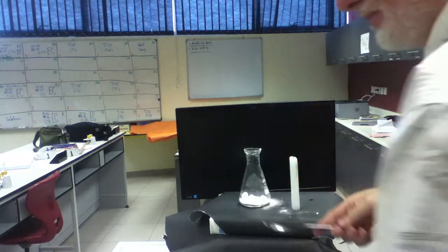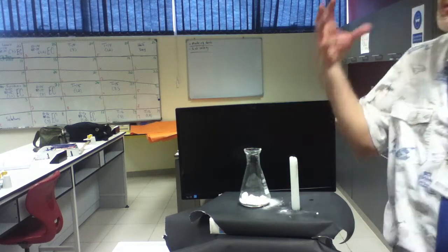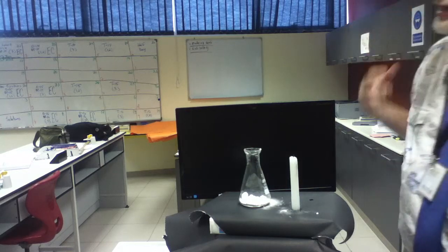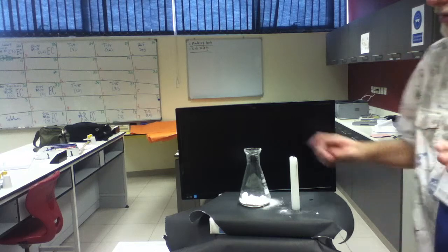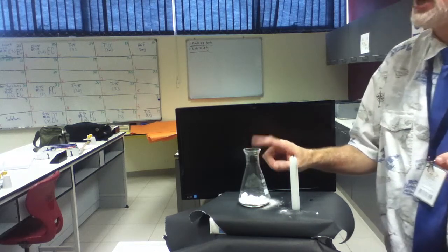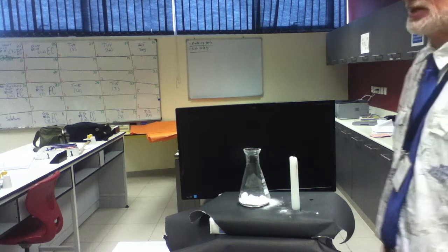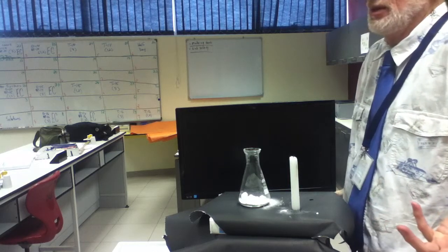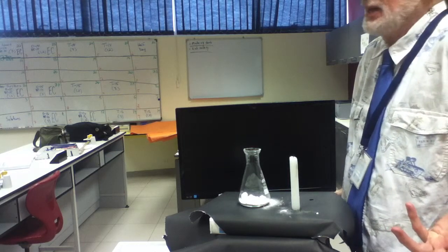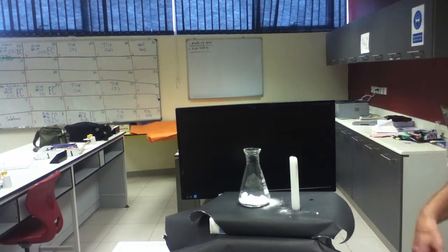Being a little sloppy. People use this, so I'm not terribly concerned, but never do this. Wear goggles and things like that. But the reason I'm not treating this as some dangerous experiment, which I really wouldn't do anyway, in front of a camera especially, is that sodium bicarbonate is oftentimes used in what? Baking, yeah? So it's not a terribly dangerous chemical.